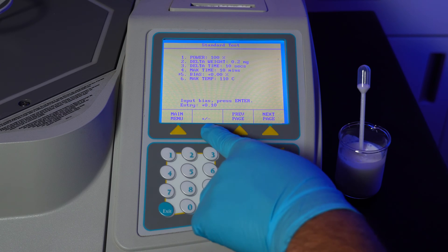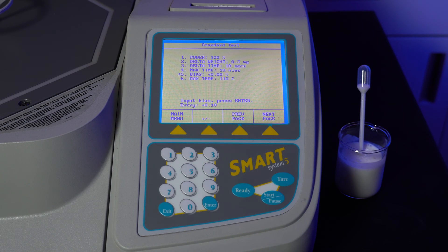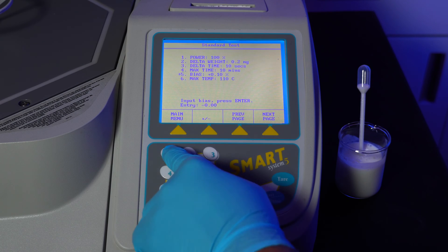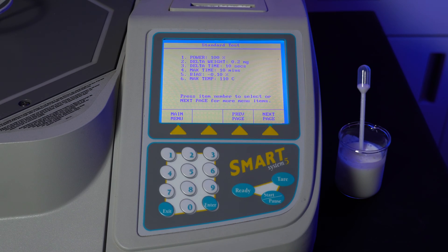Bias will remain at 0% and is only used when you are referencing results from a different testing method. For example, if an oven gives you a result of 51% moisture content and the Smart 5 is giving you 50% moisture content, the bias should be 1% since the oven test results are 1% more than the Smart 5 results. You can also set the bias to be negative if needed.